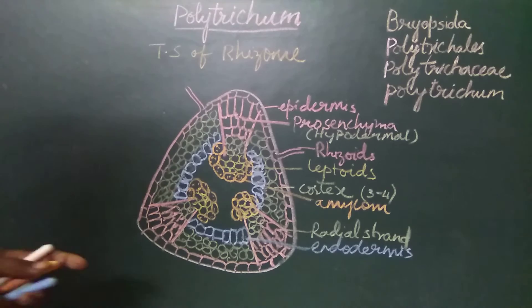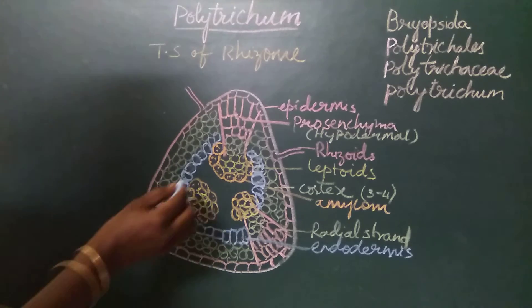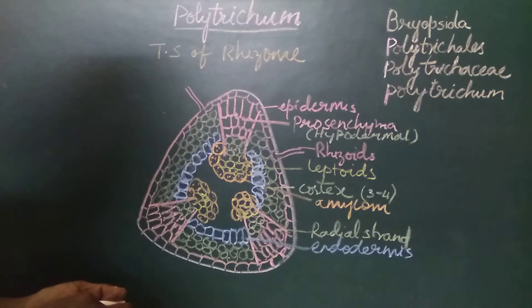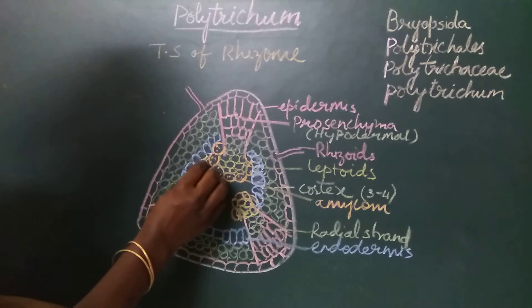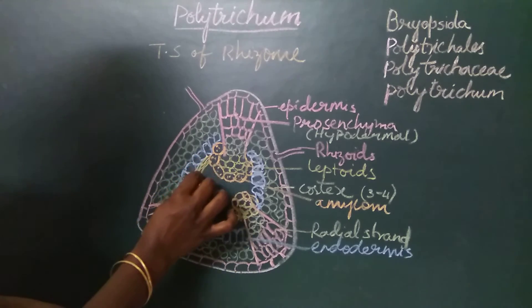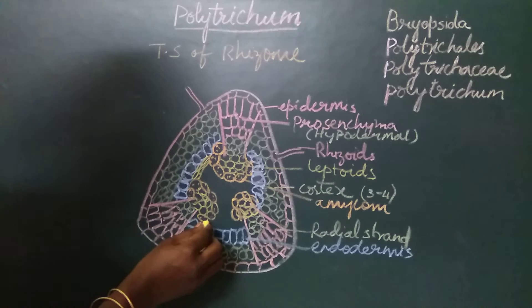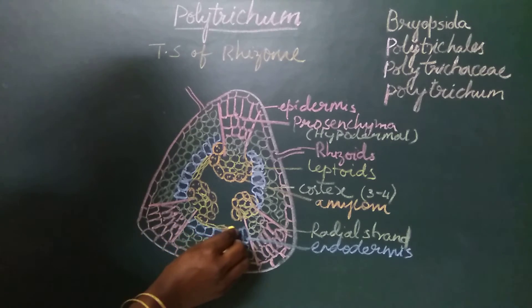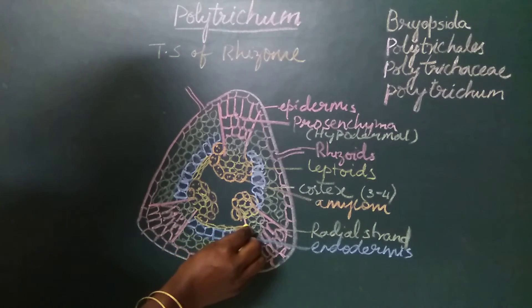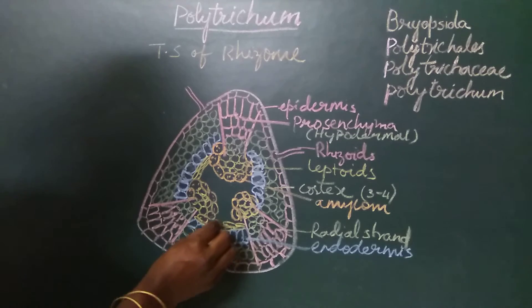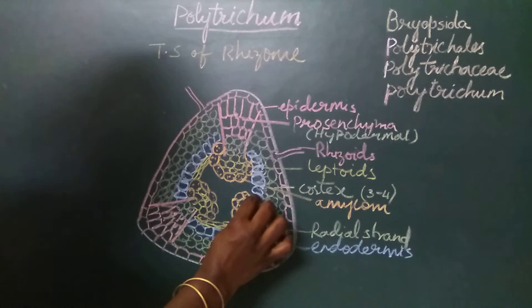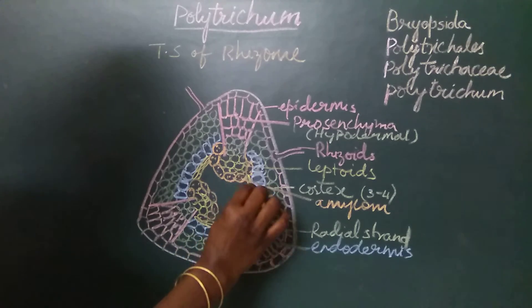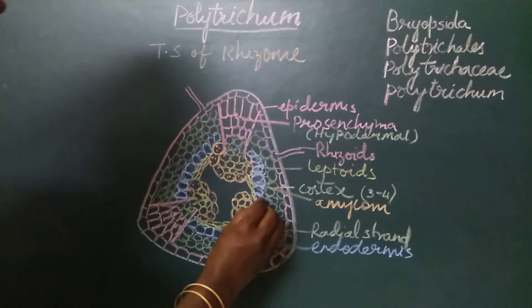Below the endodermis, two to three layers of parenchymatous tissue are seen. These two to three layers of parenchymatous cells form the pericycle.